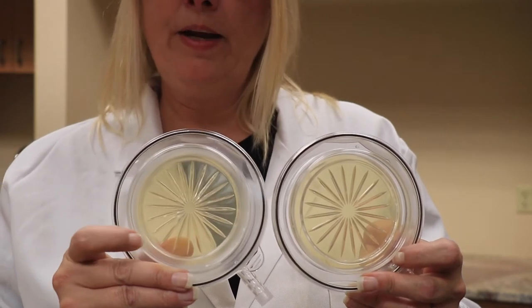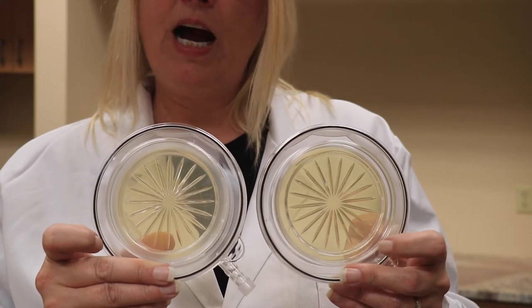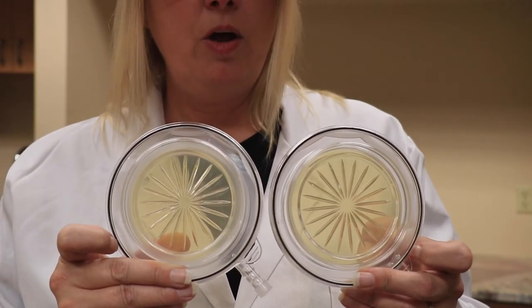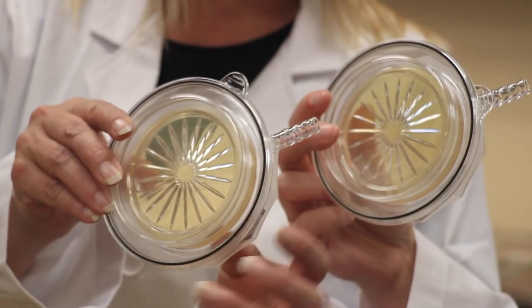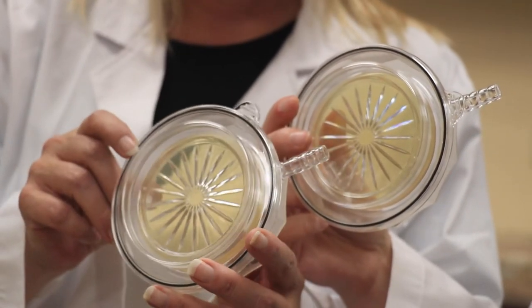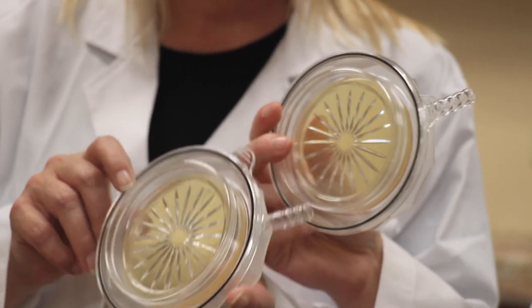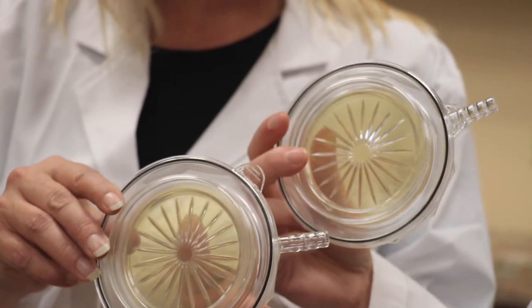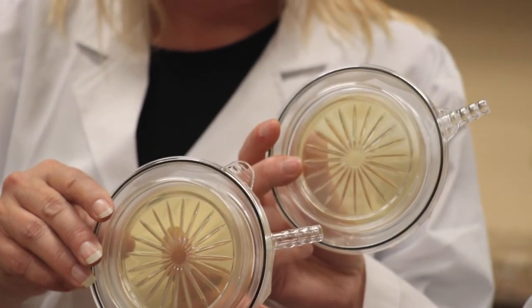The BioCap Single Use 100 liter per minute will have an opaque ring, where the BioCap Single Use 25/50 does not have that opaque ring. It's a very small difference, but it can be readily seen with the naked eye. You'll see that the BioCap Single Use has the same stem on both types — this is so that you can use the same tubing for both plates. The slits inside of the plate are going to be a little bit wider in the 100 liter per minute than the 25 and 50 liter per minute.